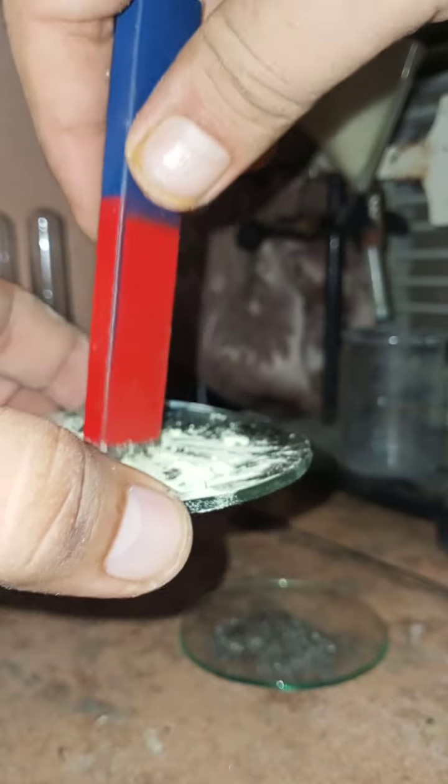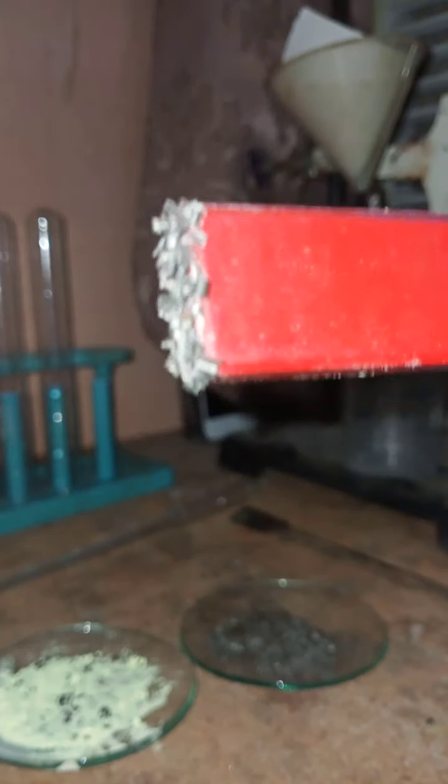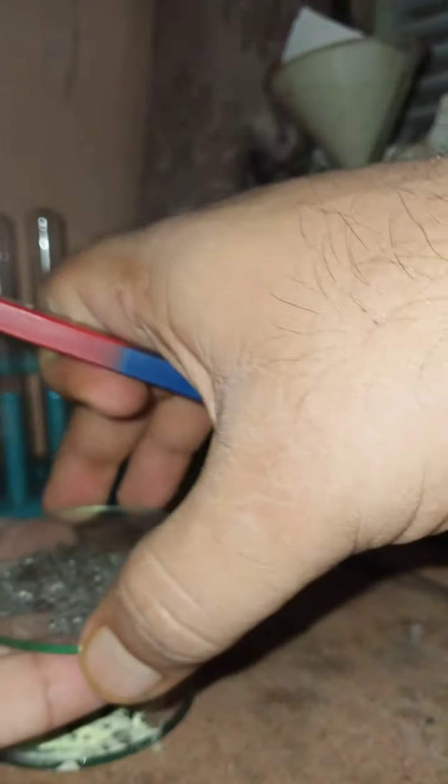You can see this is the mixture, and in this mixture I am going to move this magnet. What you can see here is that the iron filings have been separated from the sulfur powder, and I have these iron filings in my hand now. Can you see the iron filings? They are being separated by the process known as magnetic separation. So you can see that from the mixture, the iron can be easily separated by the process known as magnetic separation. Now I am going to put this magnet into this compound which has been formed.